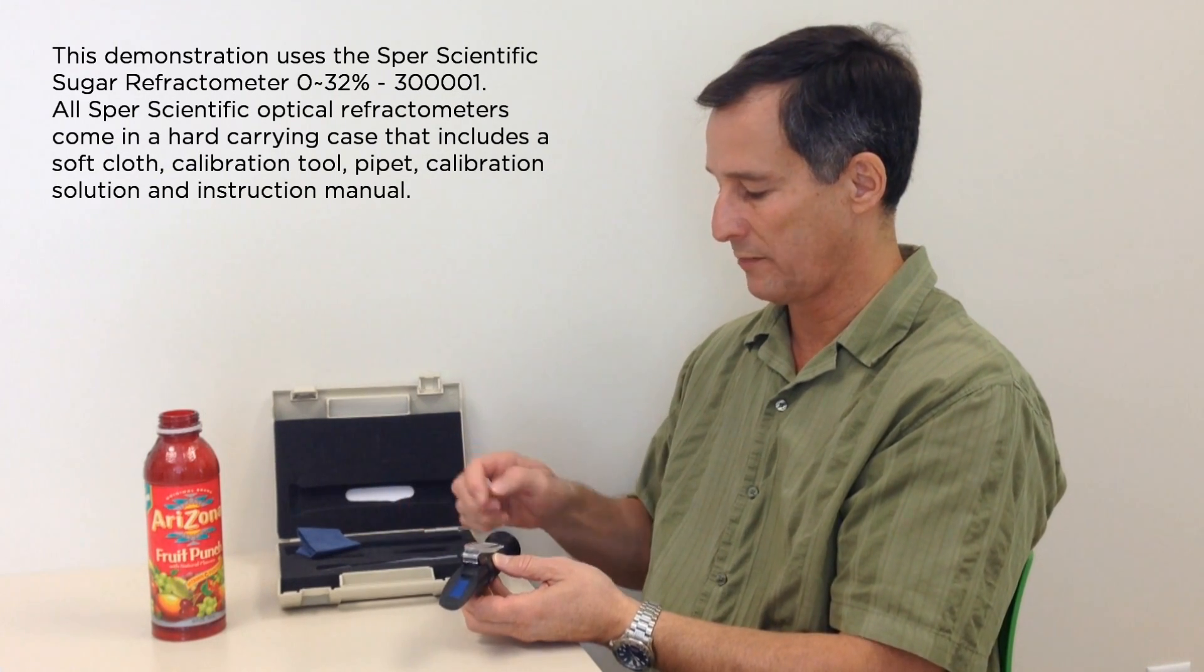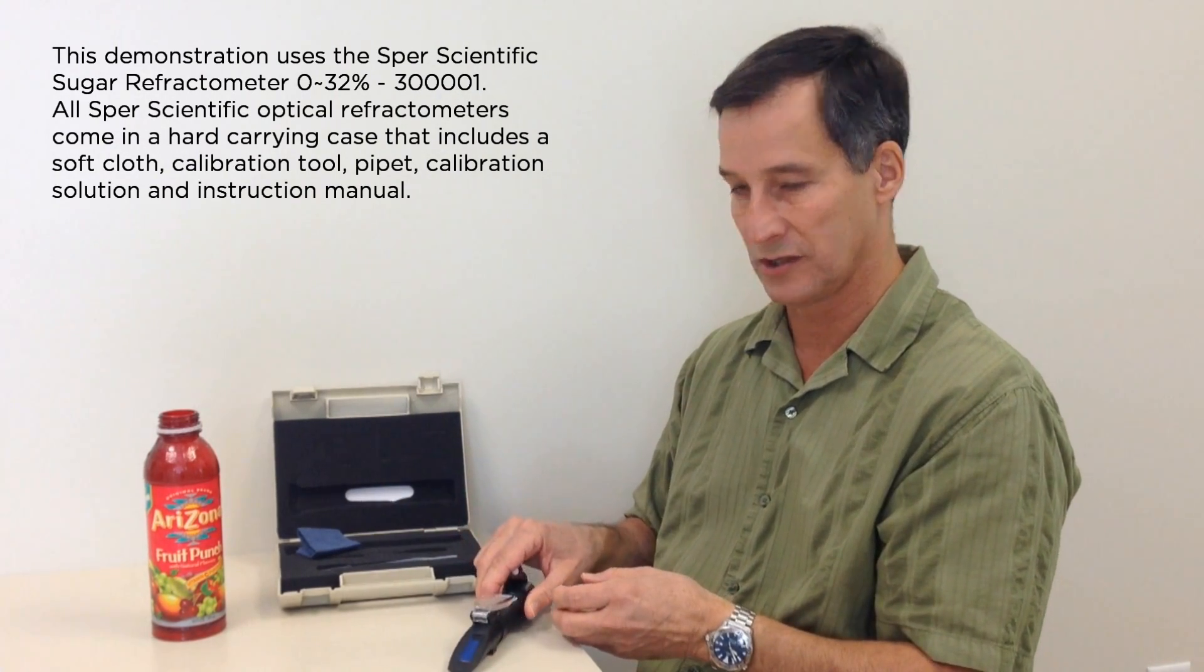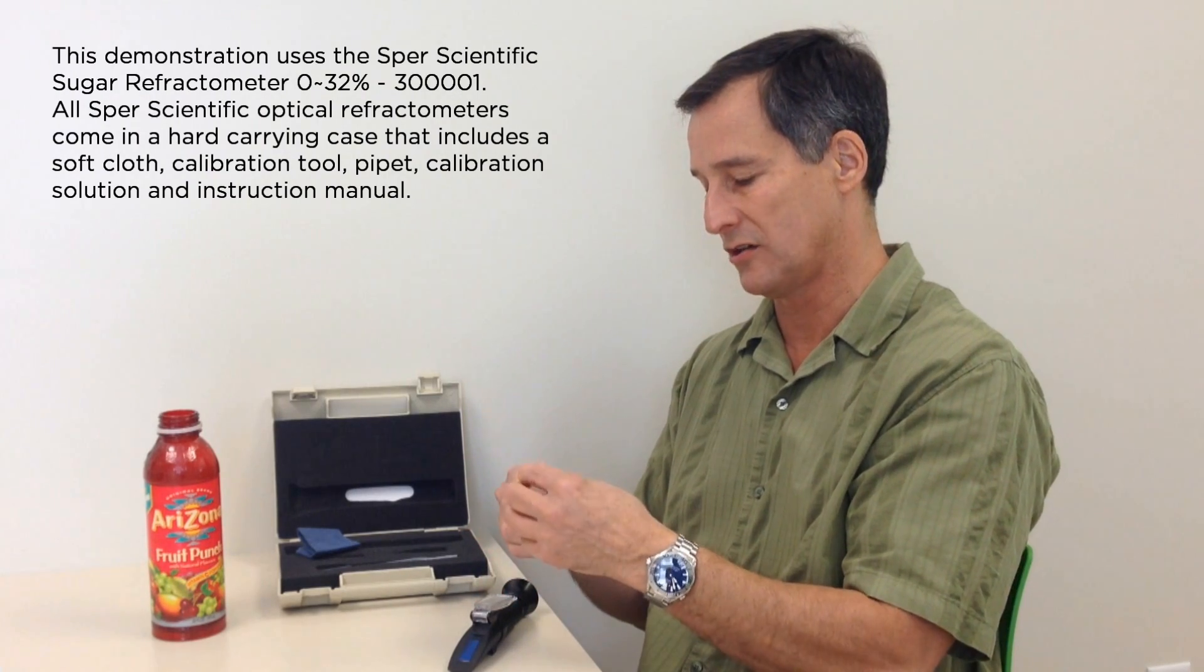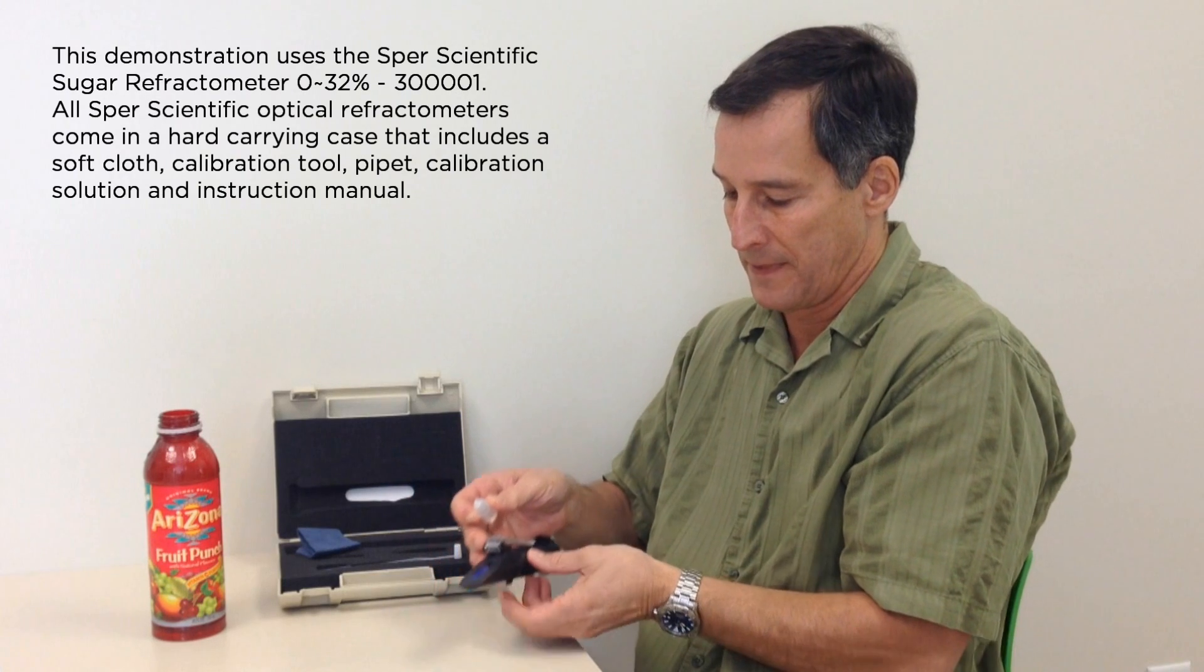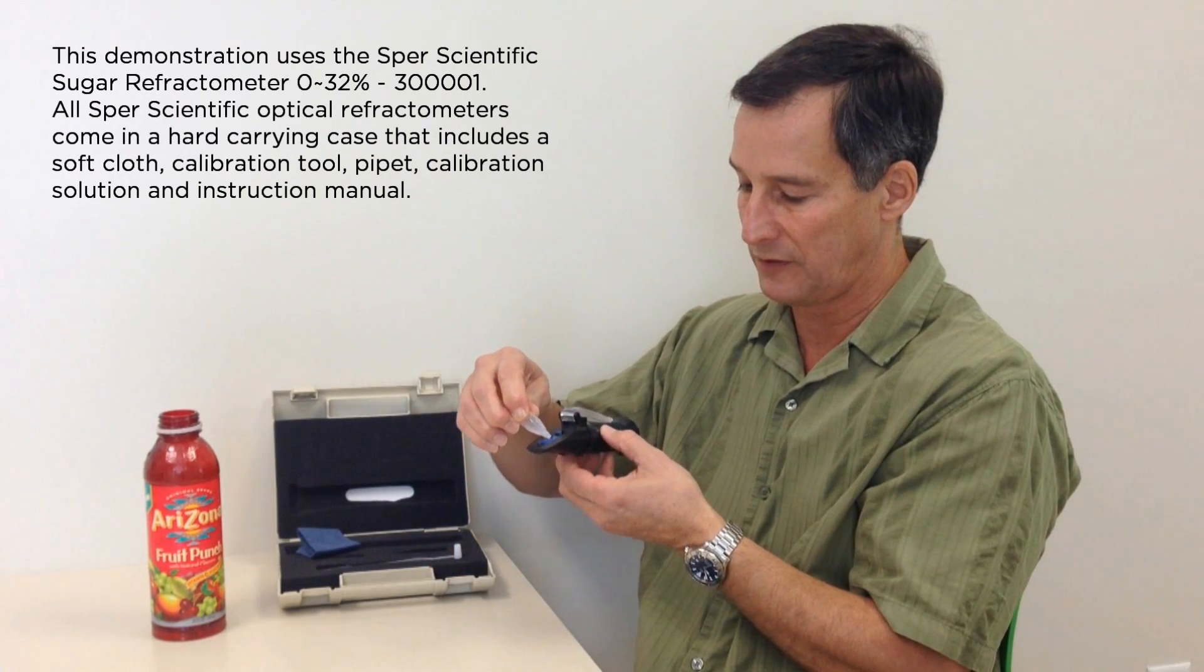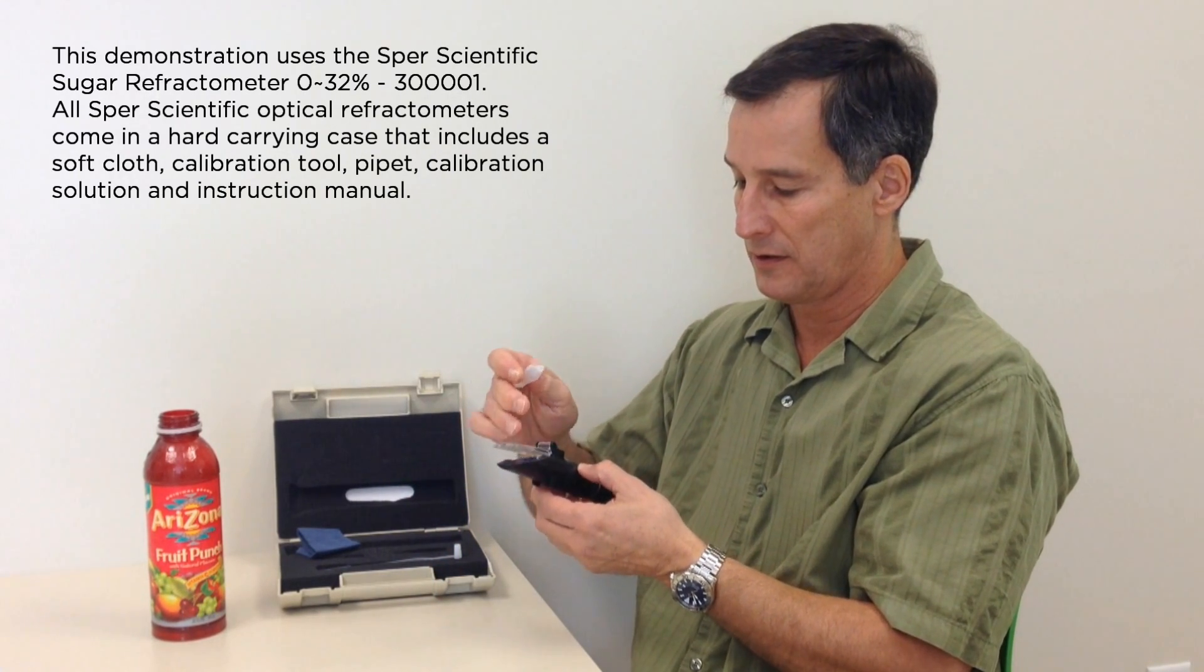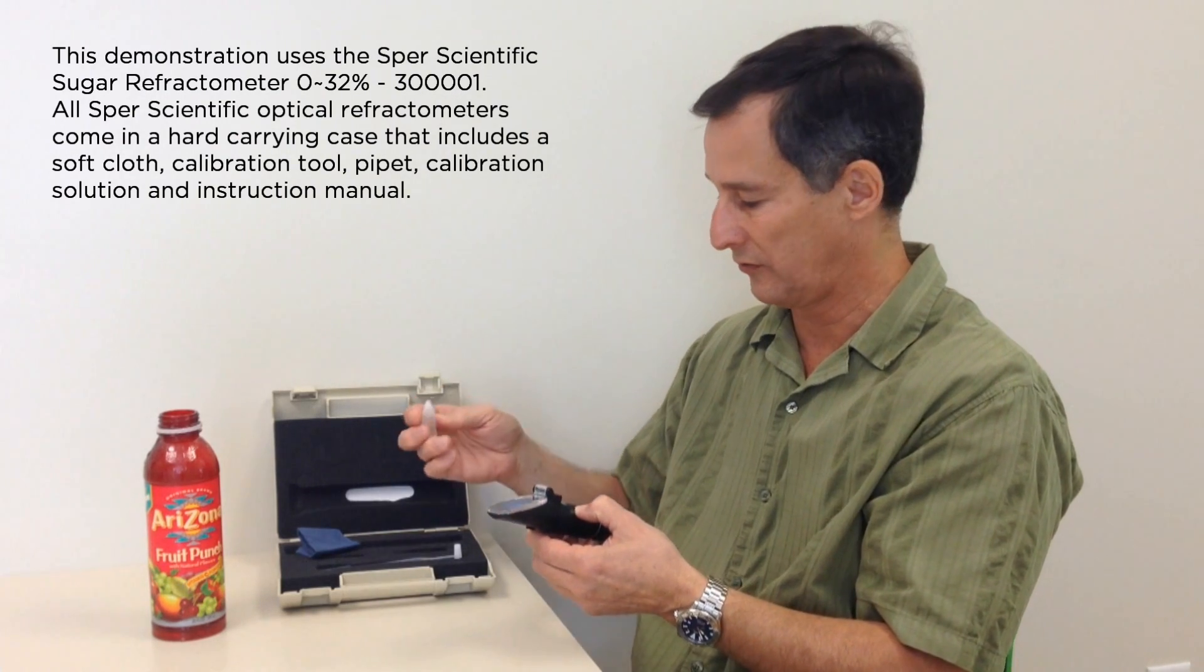We now want to put our calibration solution on the lens. In this case, our calibration solution is simply distilled water. We only need a few drops, just enough to cover the lens when the cover is closed.